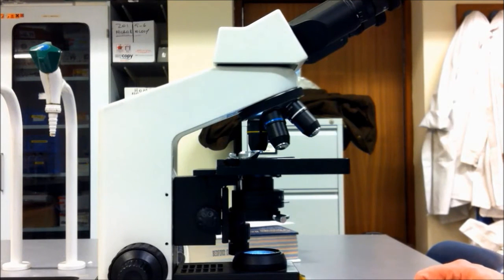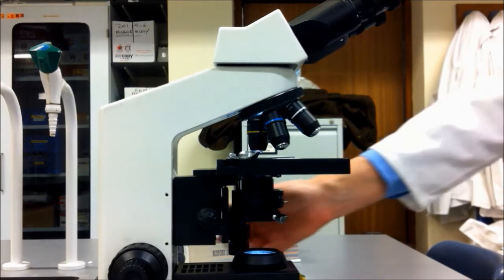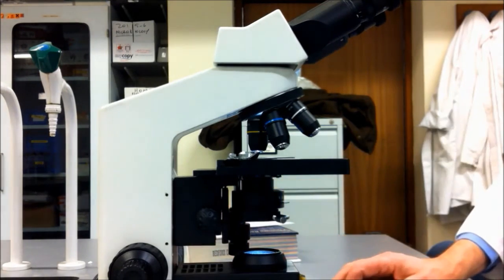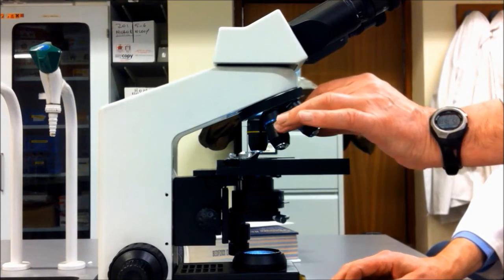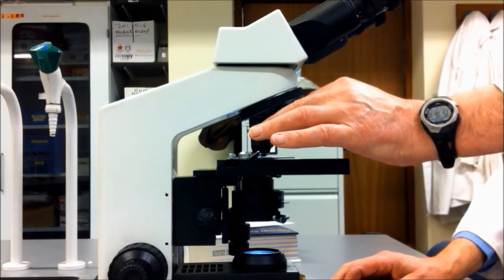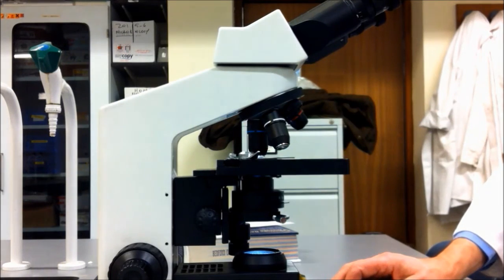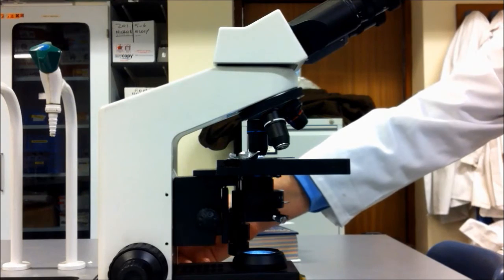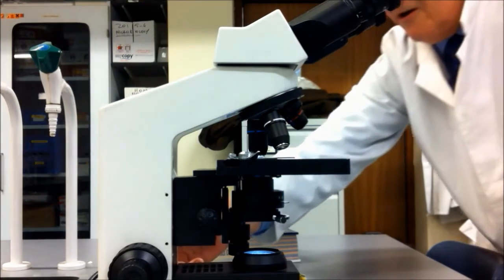When you're changing magnification, get the specimen into focus at the lower magnification. Then swing your lens round clockwise to the next highest magnification, and just refocus with the fine focusing control on the side.